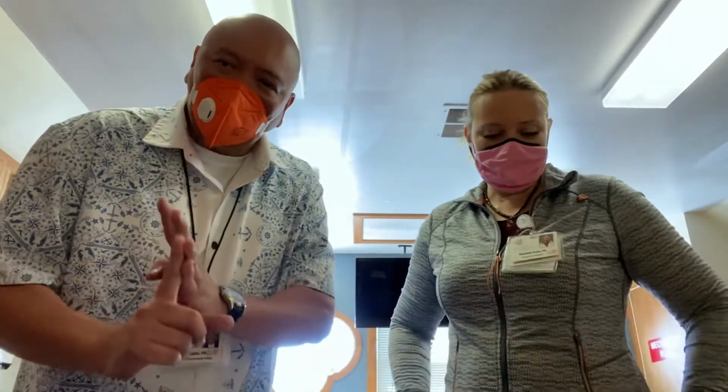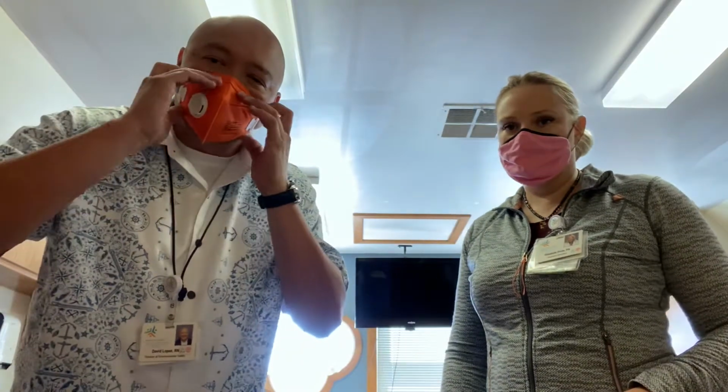When I talk about N95, it is the proper fit of the mask. Now, N95 comes in different shapes and colors. You need to make sure whatever N95 you get, you have the proper seal. You see, when I talk, it breathes, it filters the air. That's what you want. You want to make sure that it fits your face properly.